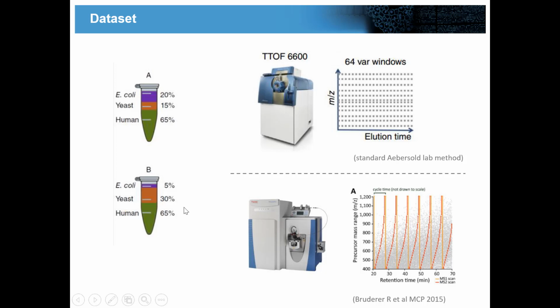And for the samples, there's a handout for each of those, right? So you can take whichever handout you want, or both if you like. The samples that we're going to be analyzing are from this paper that's been mentioned a few times, the Navarro LFQbench paper. This is a known species mixture sample where we took E. coli, yeast, and human lysates and mixed them together in predefined values.